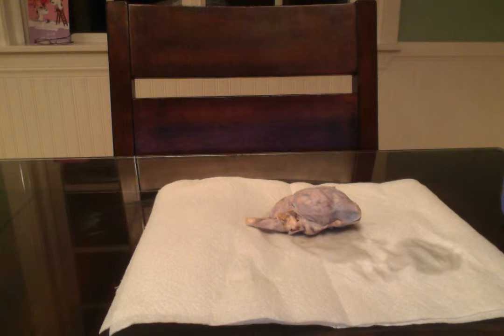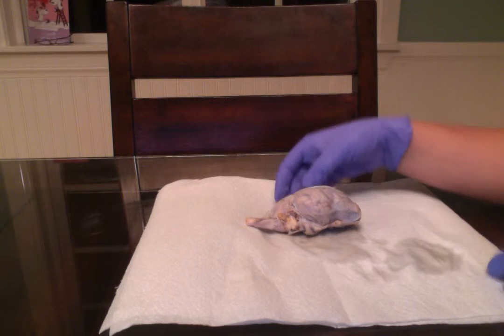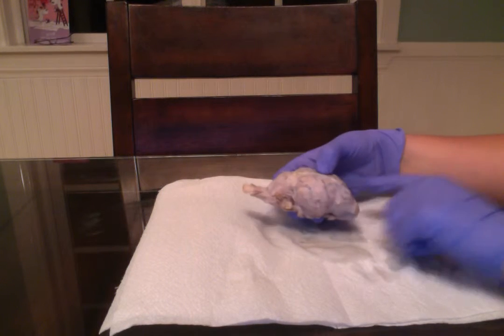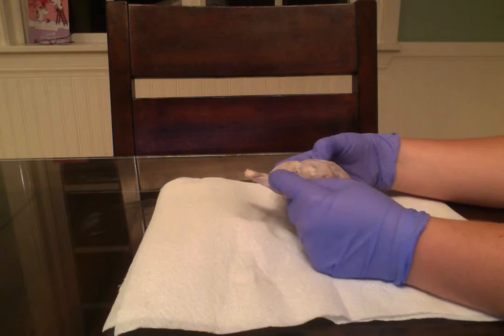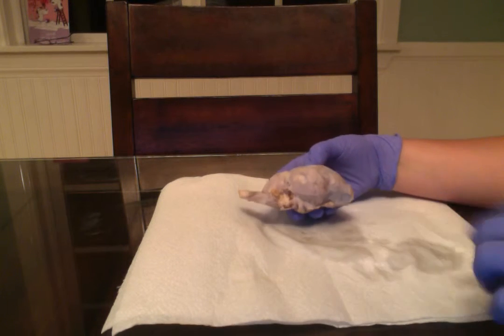My name is Charlotte Huntoon, and I'm doing a video on the gross anatomy of a sheep's brain. We are going to look at the frontal lobe, the parietal lobe, the occipital lobe, and the temporal lobe.